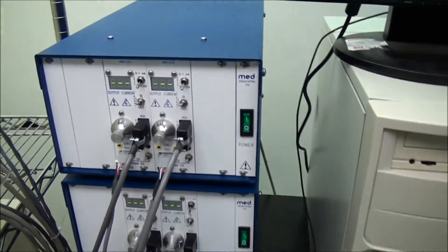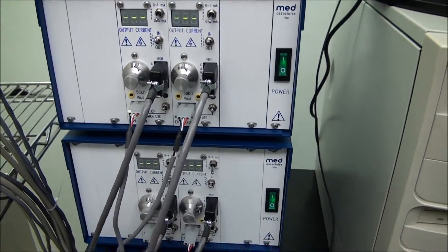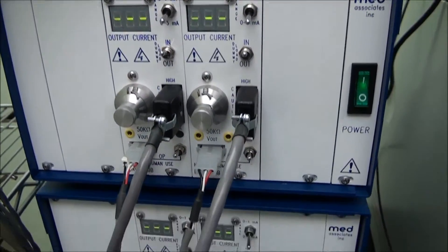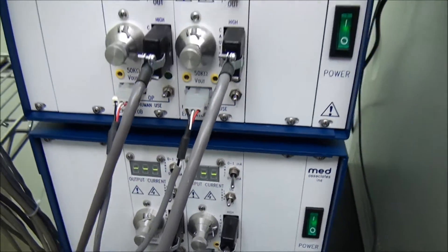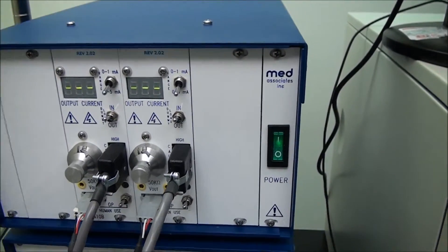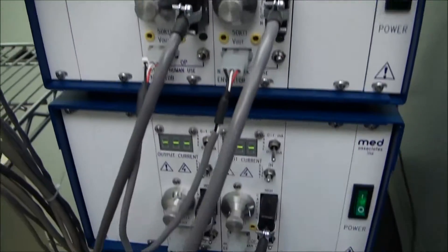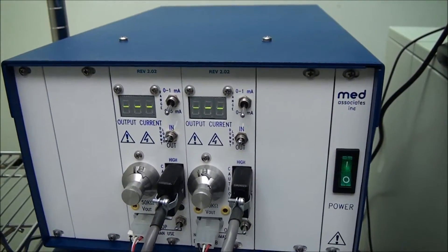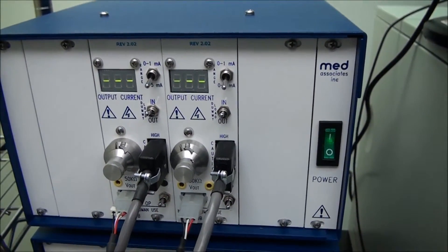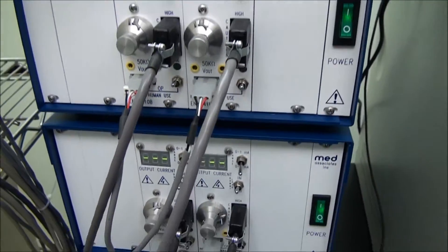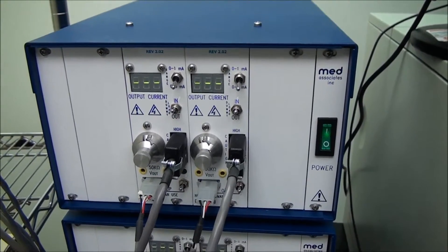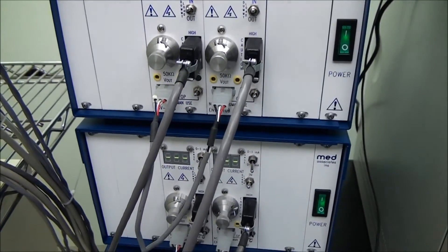And as we move over here, we're going to look at the shock module controls right here. As you notice, there's only two here and two down here. To make this system complete with eight, you'd have to add two here and two more there. The power supplies are expandable up to four modules a piece. But unfortunately, this system only comes with four modules, two on each one. If you were to want to use the stimulus shock on all eight, you would have to add those extra four modules.